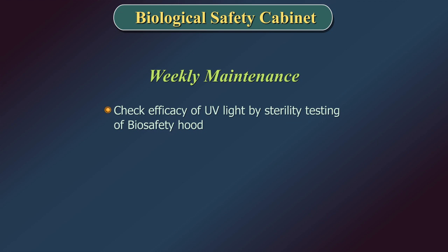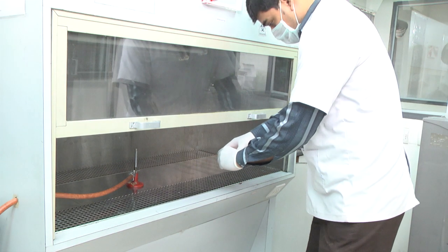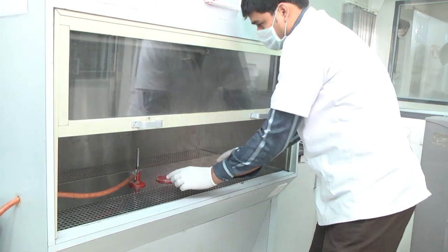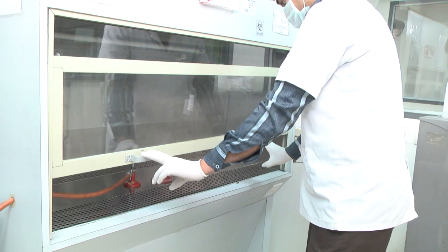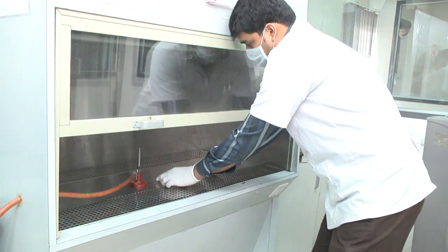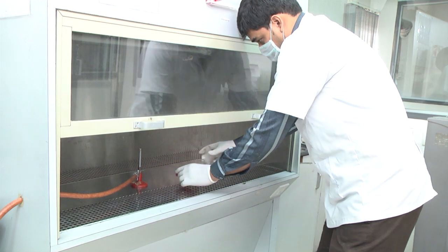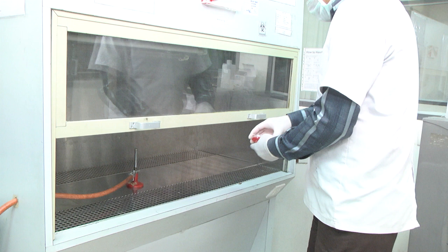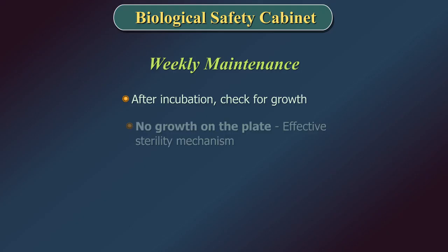Weekly Maintenance: Check the efficacy of UV light by sterility testing of the biosafety hood. Keep a sterile blood agar plate with the lid open inside the cabinet. Close the glass lid of the cabinet and turn on the UV light for 15 minutes. Remove the plate after switching off the UV light and incubate at 37 degrees centigrade overnight.